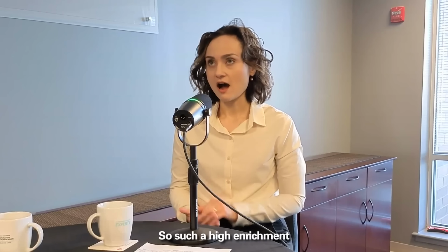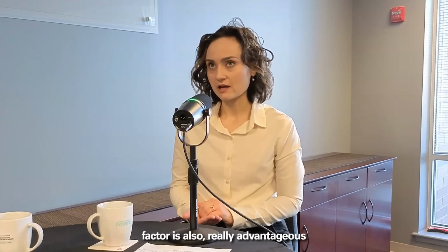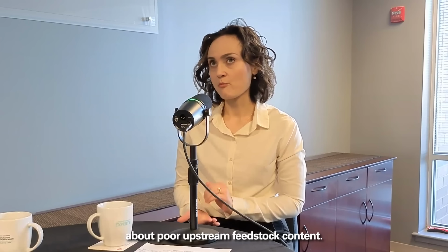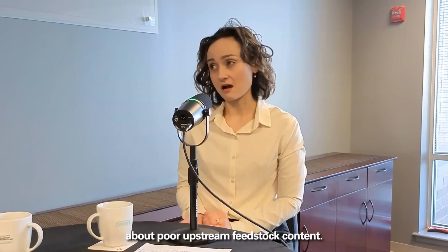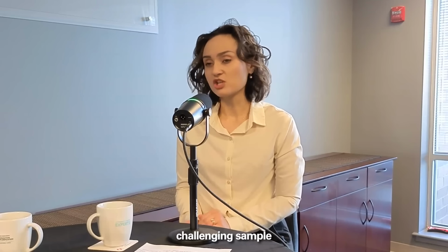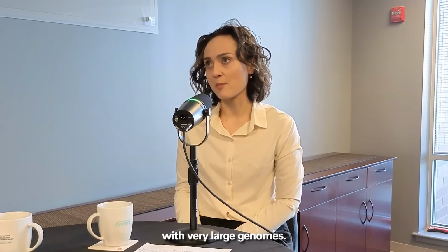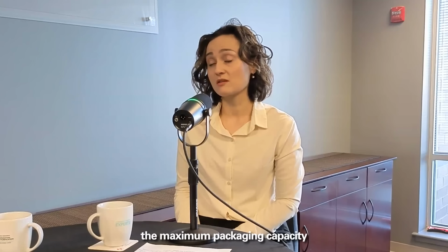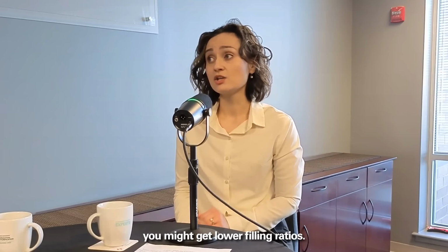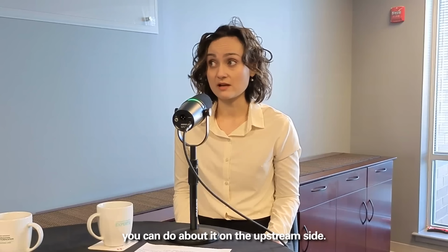Such a high enrichment factor is also really advantageous when you're talking about poor upstream feedstock content. You might have a really challenging sample where the expression is low and the filling ratio is low. This can especially happen with very large genomes. If you're approaching the maximum packaging capacity, you might get lower filling ratios, and there might be nothing you can do about it on the upstream side.